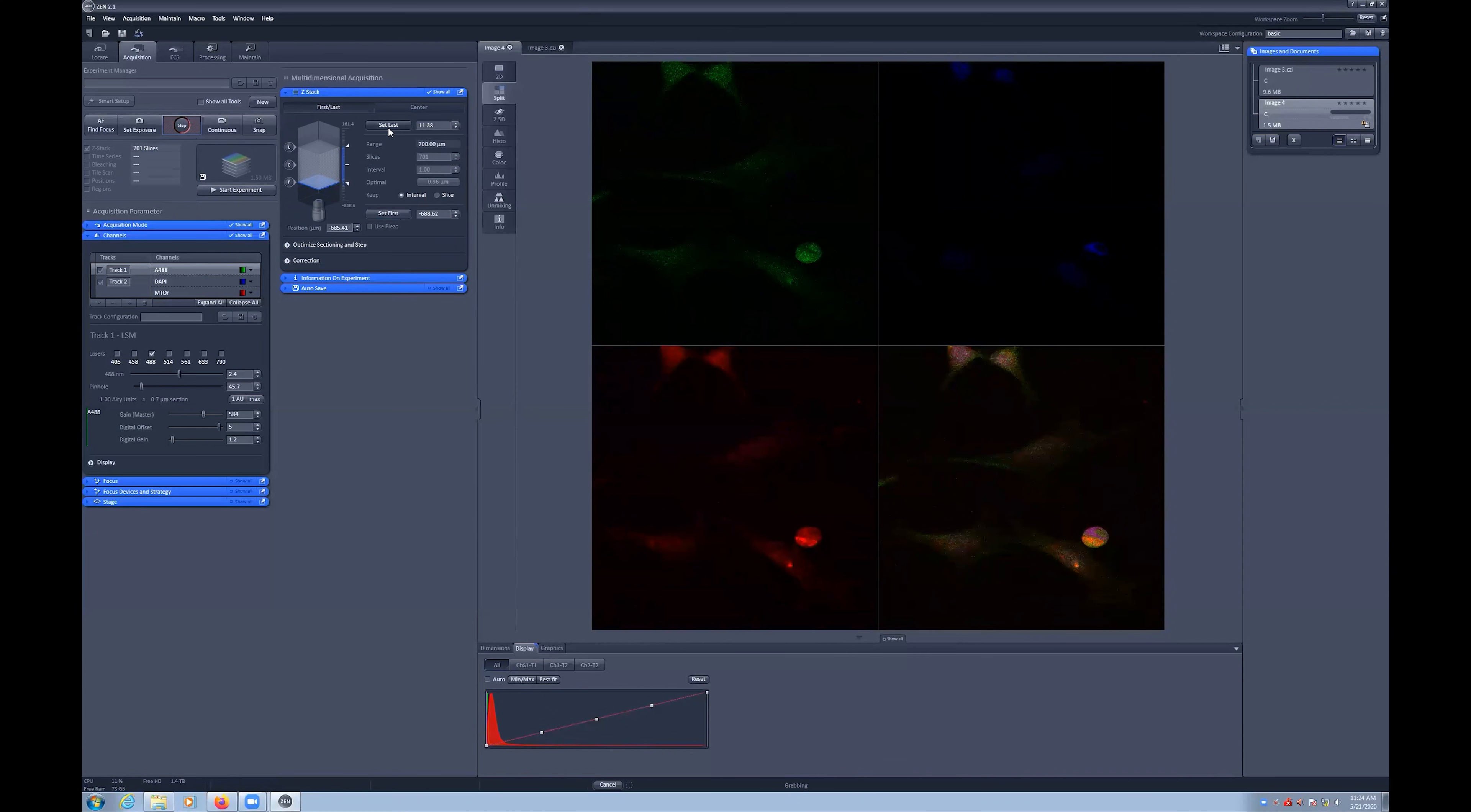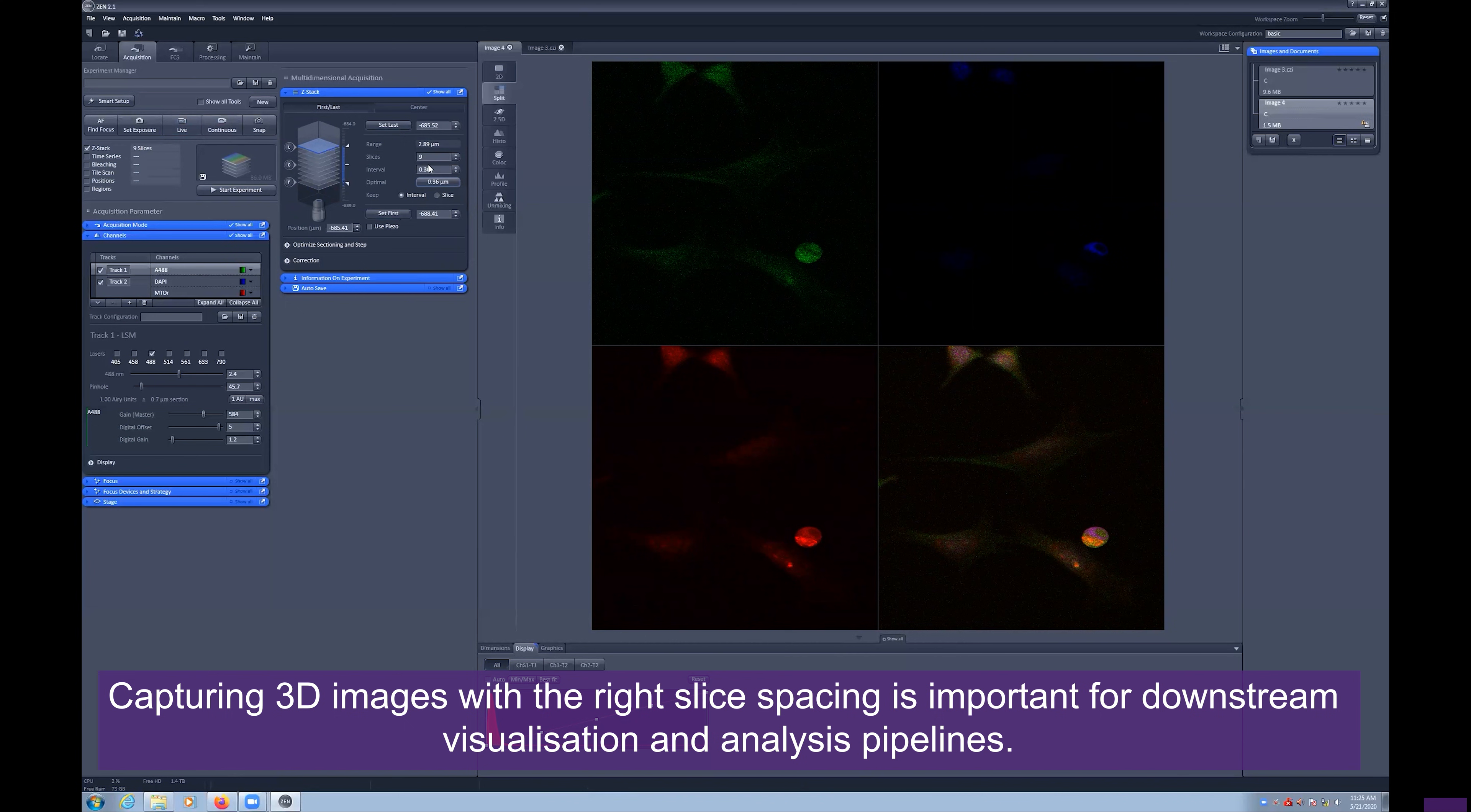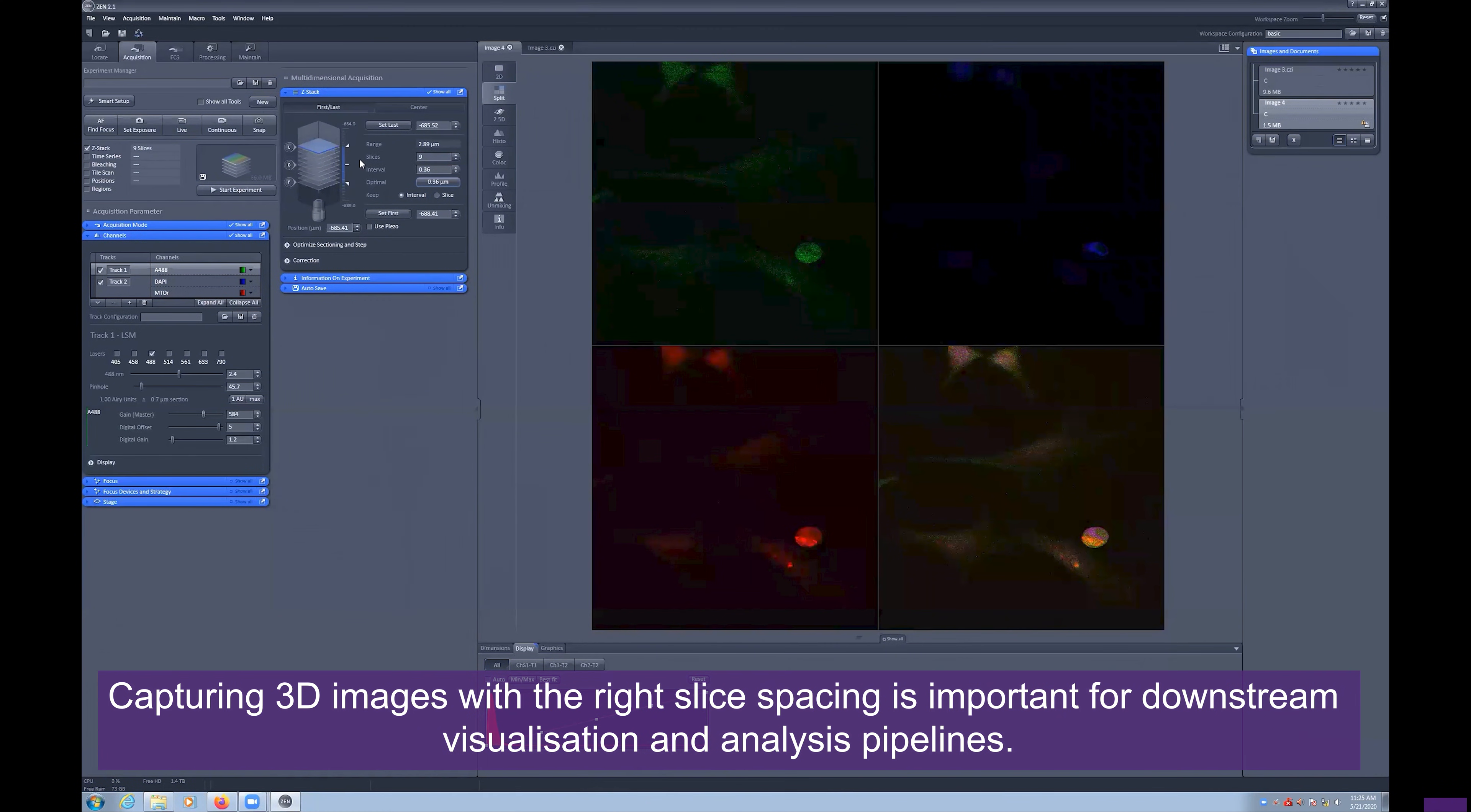Once you have defined the first and last slice of your 3D scan, you can stop the live preview and adjust the step size or slice number. We recommend using the Optimal button, which applies the correct step size based upon the Nyquist theorem. This is based upon your chosen objective and wavelength selected.